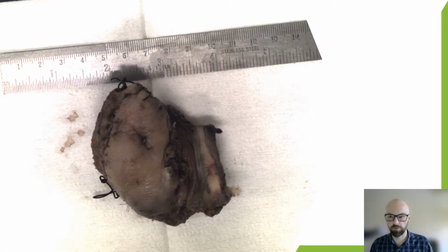So this is a typical tongue cancer specimen. We can see there's dorsal tongue here. On the lateral aspect, we've got the tongue cancer, and then we've got a little bit of attached mandible. So they come fixed in formalin, usually overnight, and that preserves the tissue and it firms it up. So it allows us to section through it a lot easier.